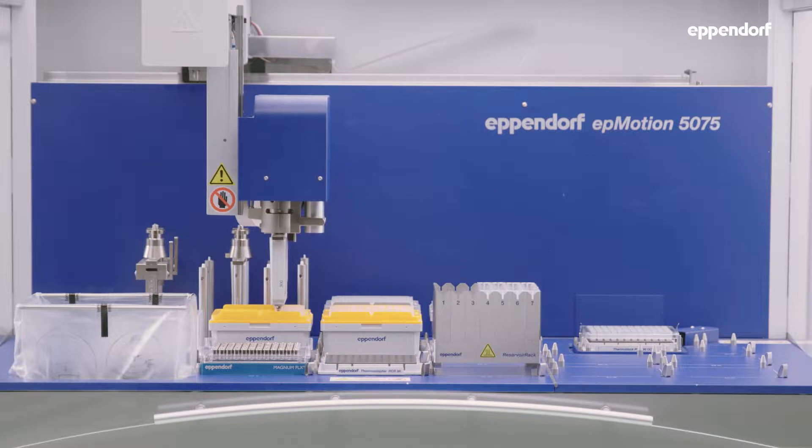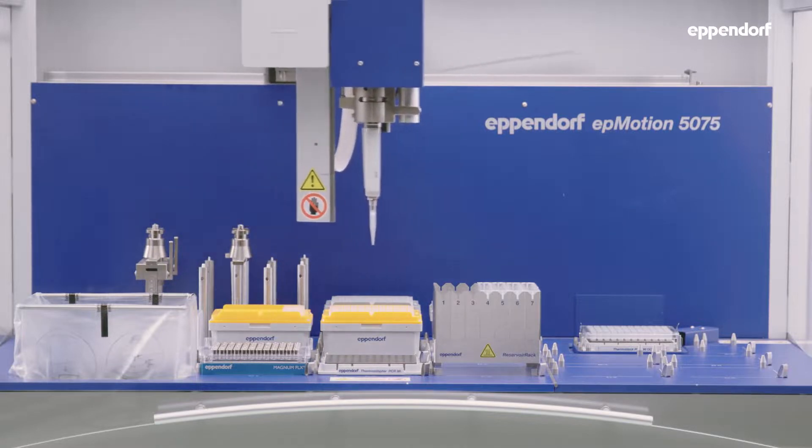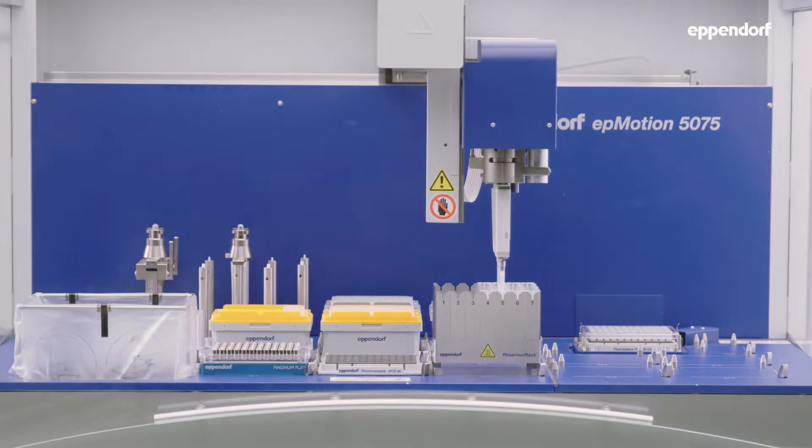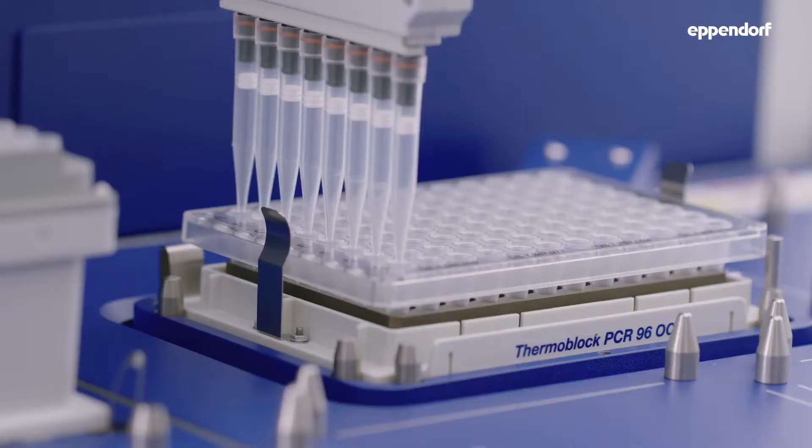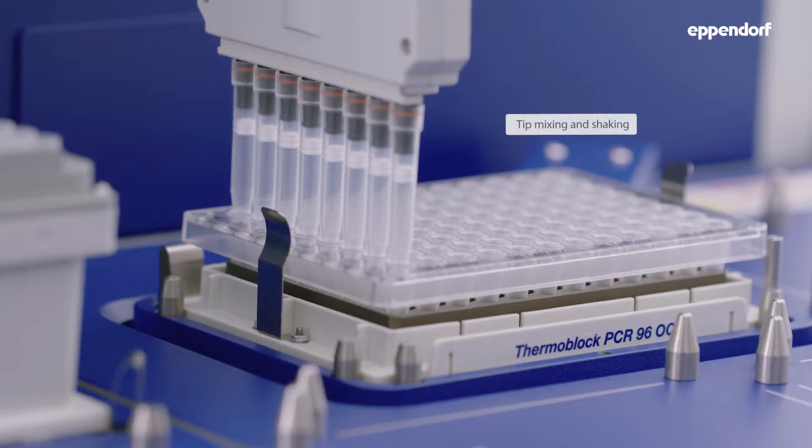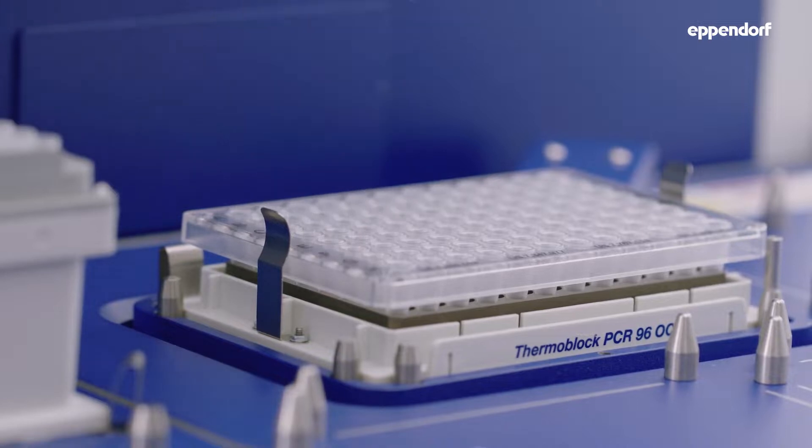Elution buffer is added to the beads using a 300 µL 8-channel pipetting tool. Both components are first mixed in the pipette tip and then shaken on the thermomixer to ensure effective elution of nucleic acids from the beads.